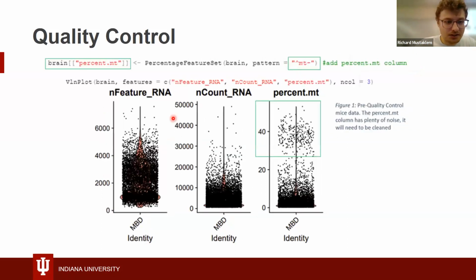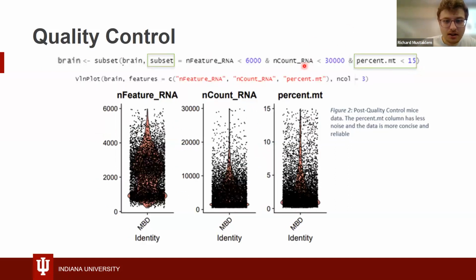We're just cutting off all these other things. There's a few other abnormalities up here and maybe some up here, right? So we're going to cut all those off with these following guidelines, replot them, and take a look at our difference. We can see that we cut off most of that data, and the data at the top that was looking a little weird. This is the first step to quality control, just making sure that there's nothing weird going on here.